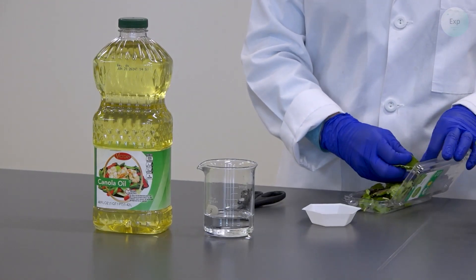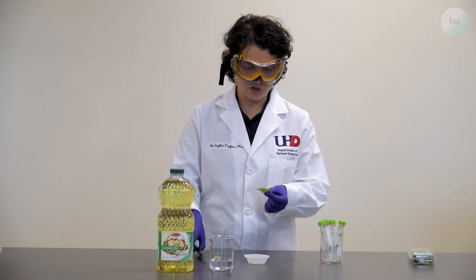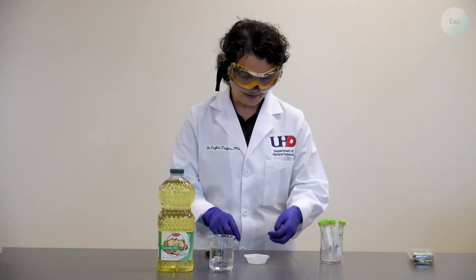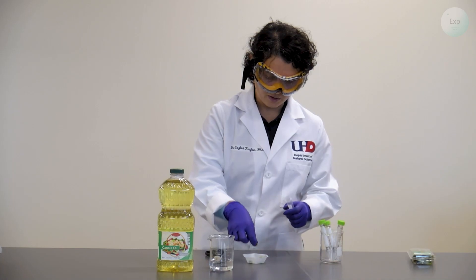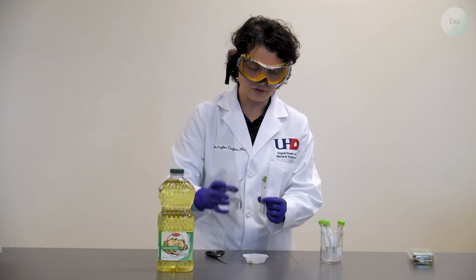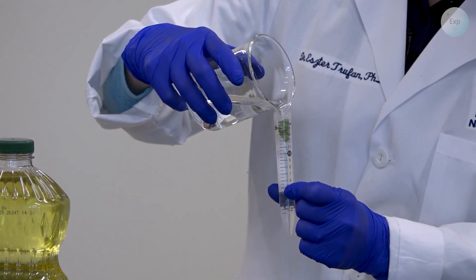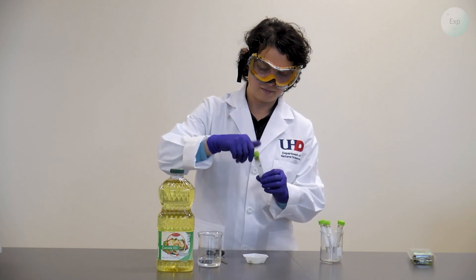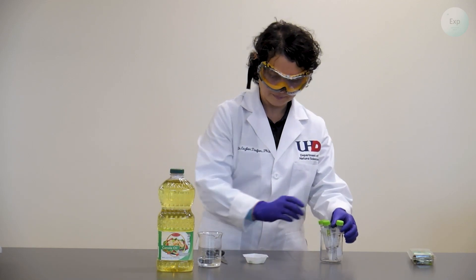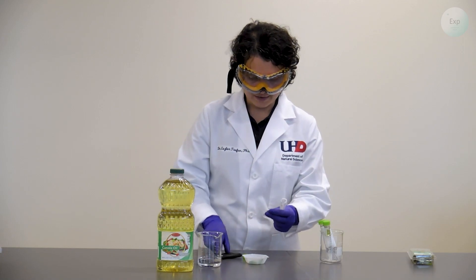I'm going to extract only two mint leaves because for one part of the experiment I'm going to need a large chunk. So I'll take this and cut it into larger pieces. I will place one of these large chunks into a screw-top vial and add approximately 12 to 13 milliliters of water to it. Then I'll try to get that sprig of mint to stay under the water layer. For the next screw-top vial I'm going to take the same sized piece of mint and cut it into small bits.